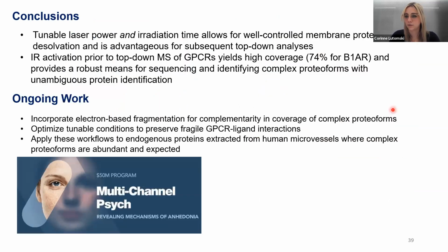And so just to conclude, the developments that we've made with this IR laser give us tunable parameters in terms of laser power and irradiation time. So we can now well control how the membrane protein gets released from the detergent. And we found it's extremely advantageous for the subsequent top-down analyses that we're doing.